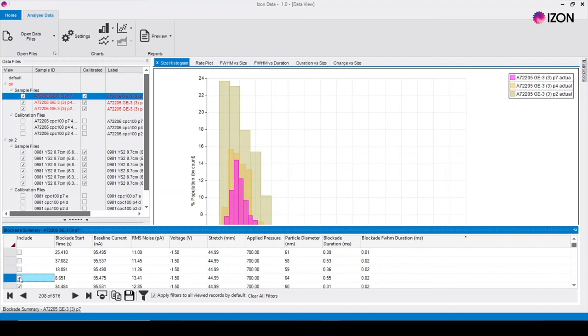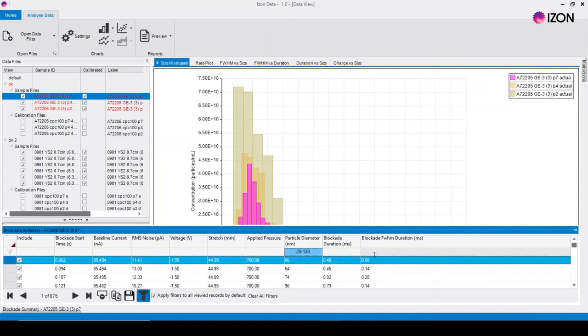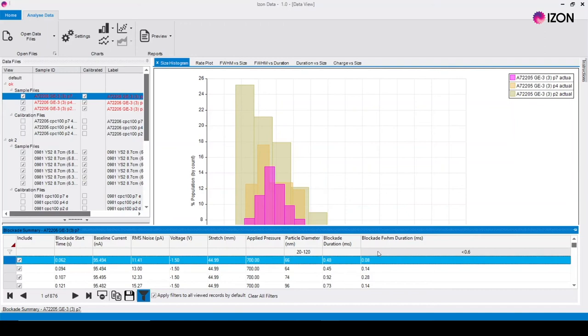To apply a filter to the data set click on the funnel icon then select the filter box in the category you would like to filter. Fill these in with the values you would like and this can be a single range, multiple ranges or just simply a less than or greater than value.